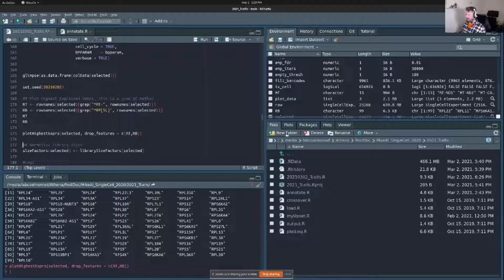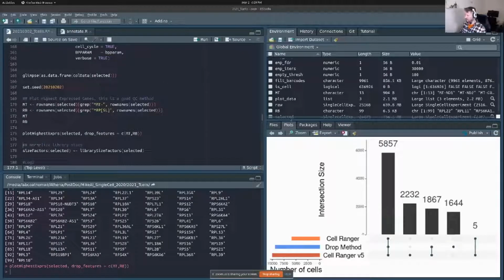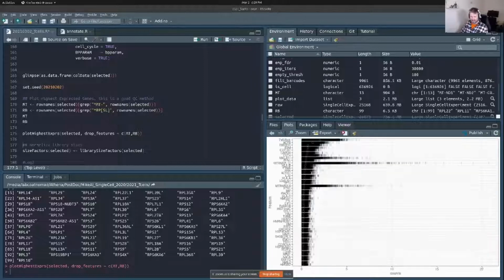So that's going to plot itself. I'm going to have to switch back to the plot tab. Hopefully it loads. While that's loading or not loading, I will jump into normalization. Oh, oops, no, it's the old plot. New plot, please. So there's lots of types of normalization. Obviously, Henry didn't go over every kind because he can't. It's impossible. There's not enough time.